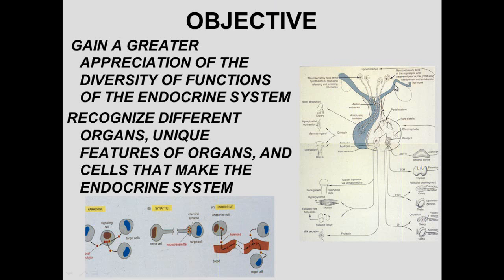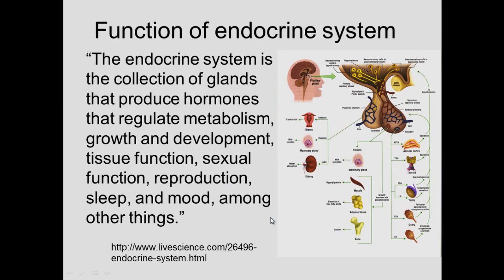Here's the pituitary, hypothalamus is up in this region, and there's a reciprocal relationship between the pituitary and various organs of the body of the endocrine system. The endocrine system is one by which hormones are produced by a cell, and it goes into the bloodstream, and it interacts with cells with receptors that match that hormone in some target distant place.